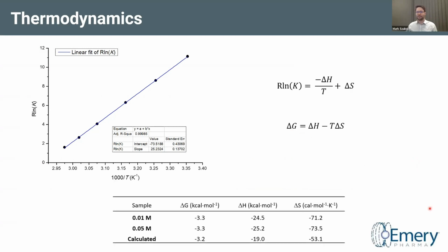And I did this for several compounds, and this is a very nice thermodynamic parameter which can tell you how these systems are going to work, and, for example, what amount will be in the dissociated form at a given temperature. So these are very nice properties which you can calculate from simple one-dimensional spectra.